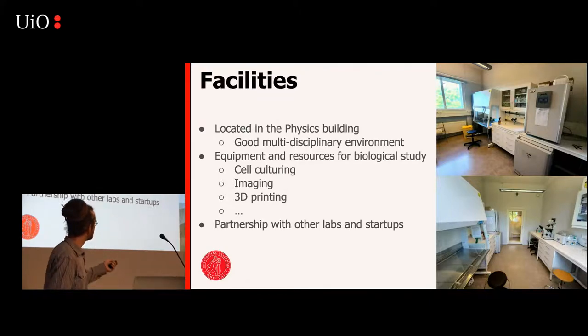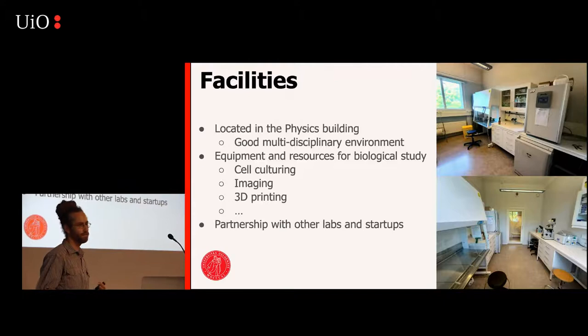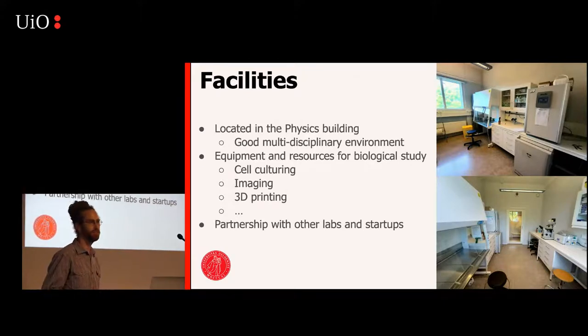And you can see that now we have a very nice facility where we can actually do real biological studies. So we mounted all of this, and now we are able to, for instance, cultivate cells and do basic studies, and we also have access to microscopy tools and everything like that to do simple or not too advanced biological studies, enough to do multidisciplinary studies in biology. So here you can see what it looks like.